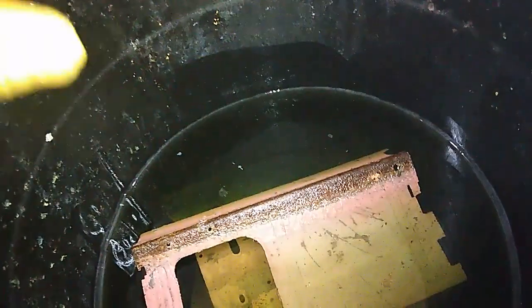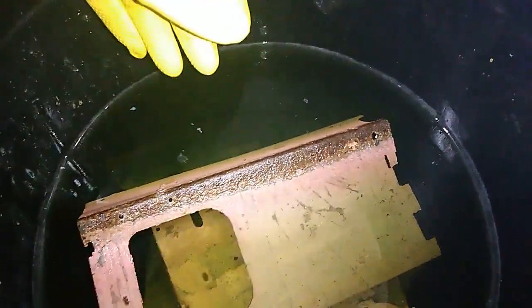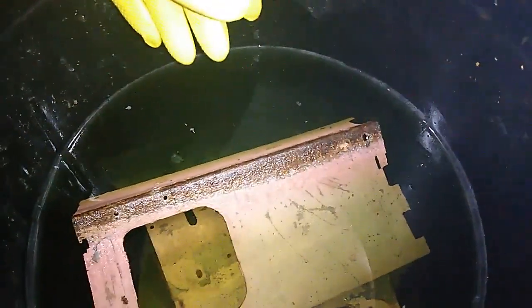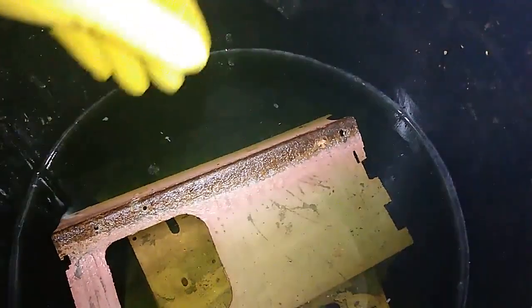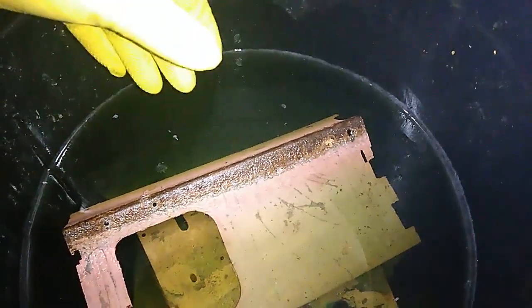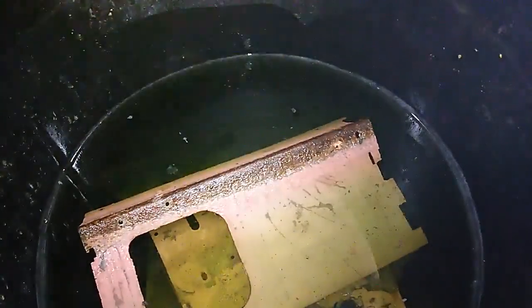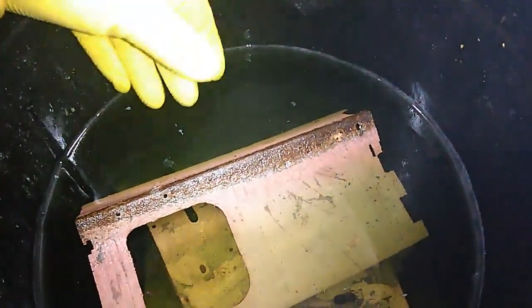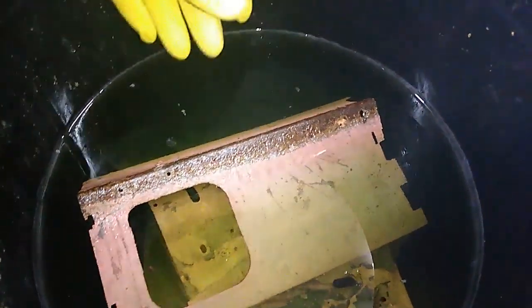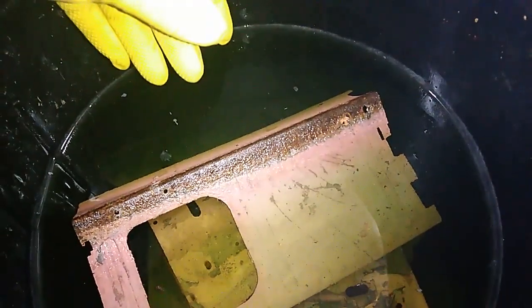Hey guys, welcome to a new video from Reina and Dusan. In today's video I'm going to deal with my waste acid. I need to clean up this little barrel with the old aqua regia solutions because I need that barrel to put new waste acid inside. You've already seen a couple of times how the right disposal of waste acids actually works.